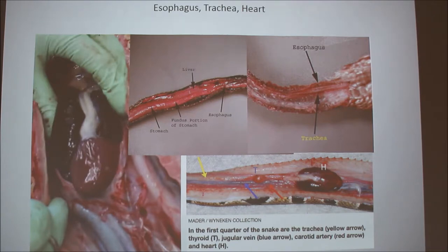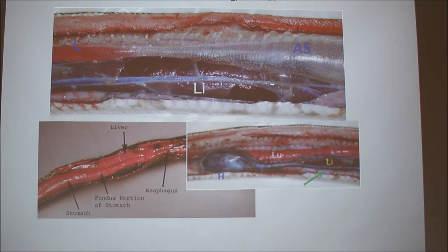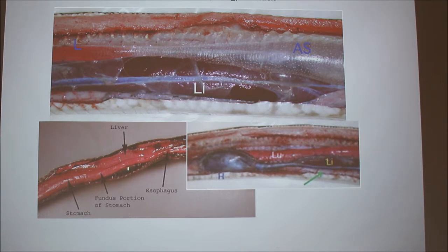And then the second quarter, we have the heart, the liver, the lung, and the stomach. So this is the lung here, and usually when you cut open a snake, sometimes you can still see air in the lungs. Here is a filled lung air sac, and the liver is lying right beside the lung. Sometimes the heart is really close, but still the liver and lung are right beside each other.